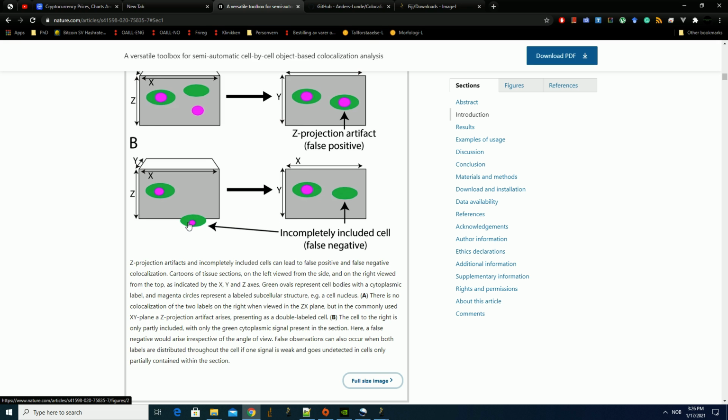So all of this green would be ignored, because it is not a reliable source to say that this cell is negative. In this case we would be wise to analyze only the nucleus of every cell, and that is the only way we can say if a cell is positive or negative for a nuclear localized marker: by having the nucleus be the proxy for the cell itself. So we should not look at the cytoplasm in this case. We will see how we can output only the nuclear signal and check what's inside the nucleus with this plugin.